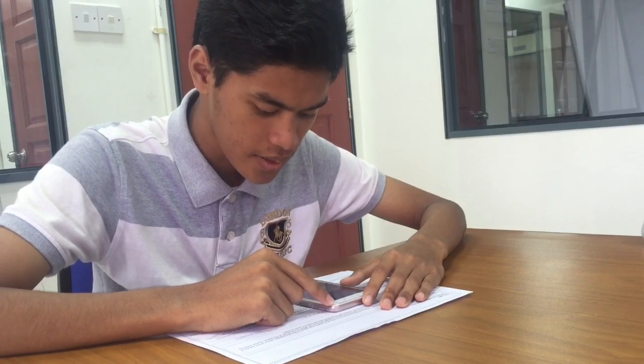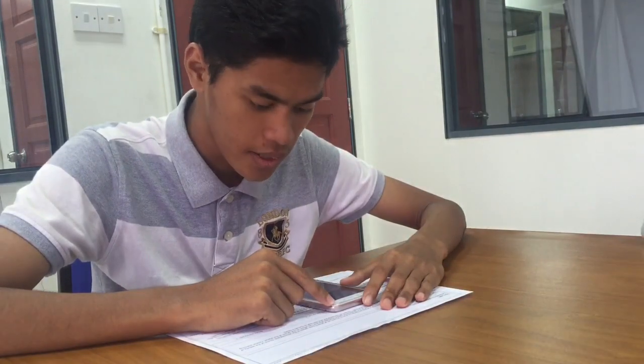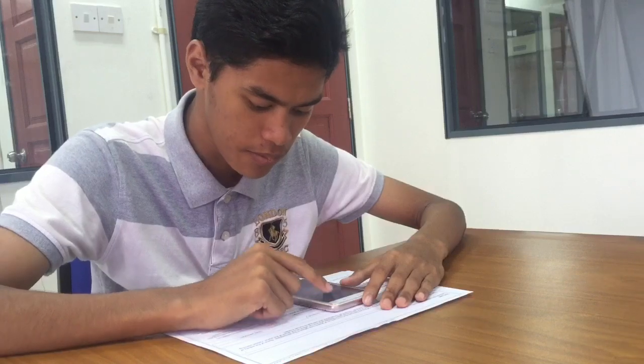The acetanilide is pure. It can be recognized through the color and weight. Pure acetanilide is white, small flakes, and much lighter than the impure one.